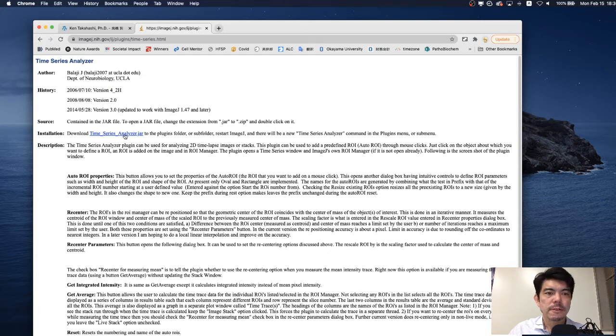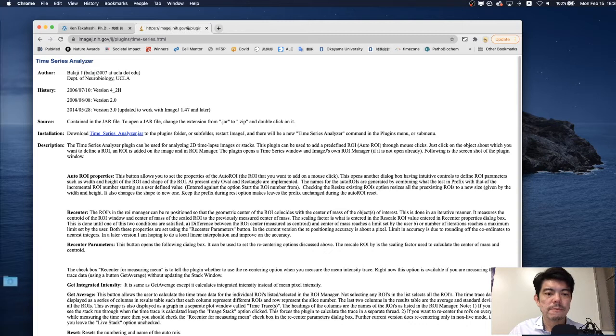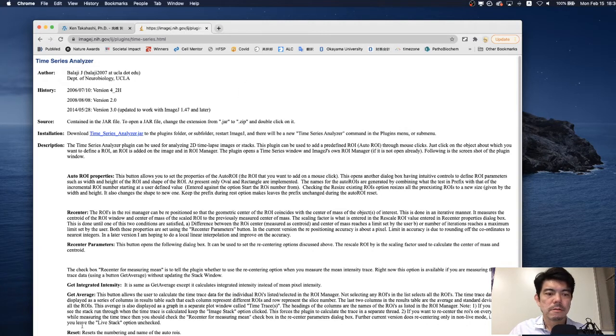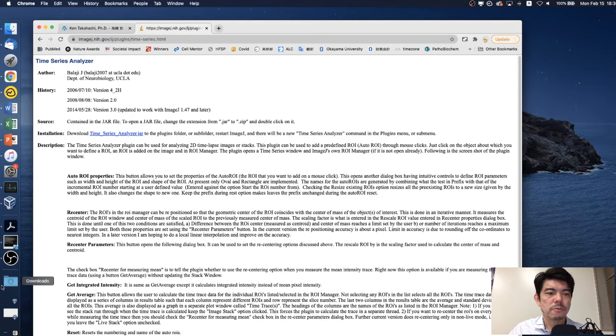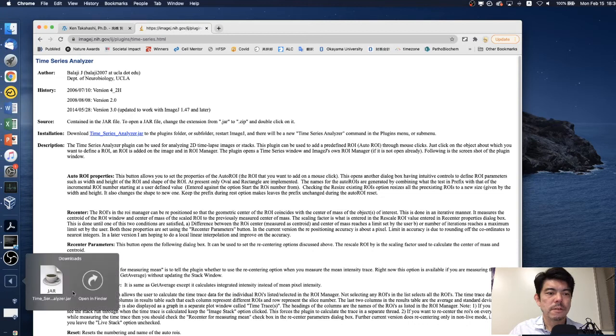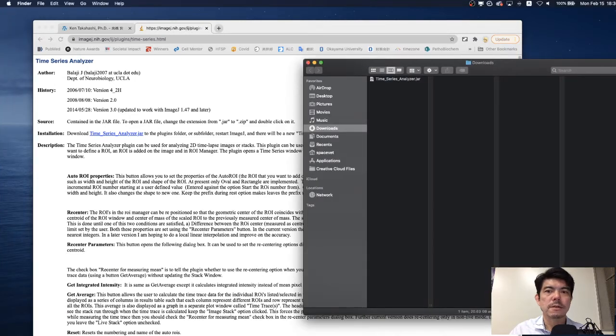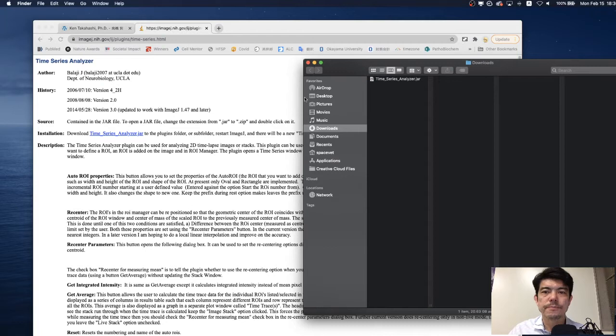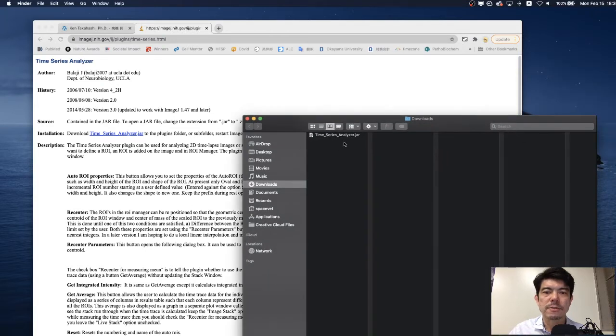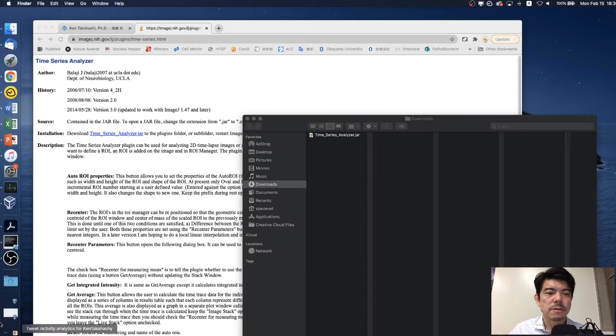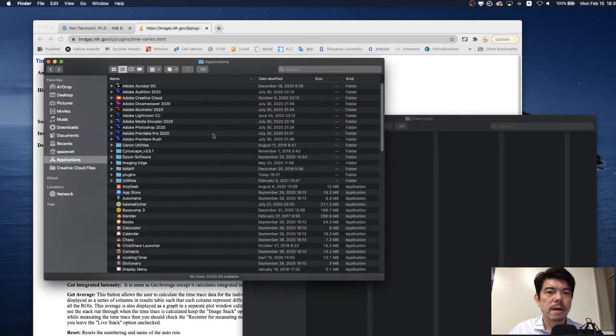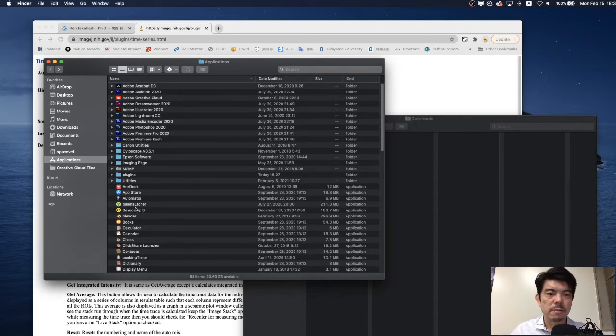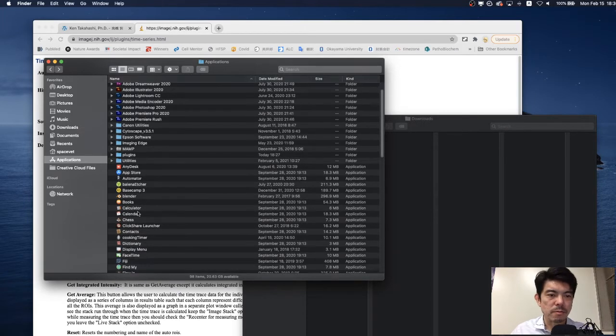Click this and download the file. We open the download folder and here we can find the downloaded Time Series Analyzer.jar and now we open the application folder.